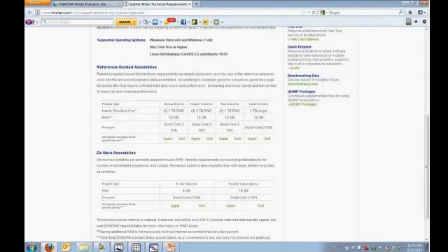You see the only difference here is the disk for temporary files. So if I have a human genome, which is the largest of the data sets that we'll do, versus something that's small like yeast, I need more space to process temporary files. Now these files aren't saved. While we're processing the data, while the engine is working through the template files, through the hundreds of millions or billions of reads, it'll create temporary files and then remove them when the assembly is done. So this is really a scratch disk space.